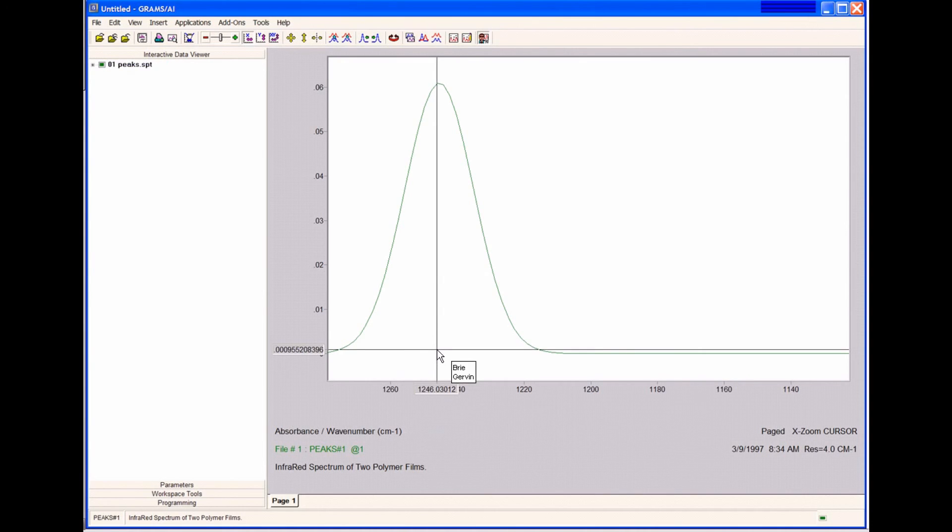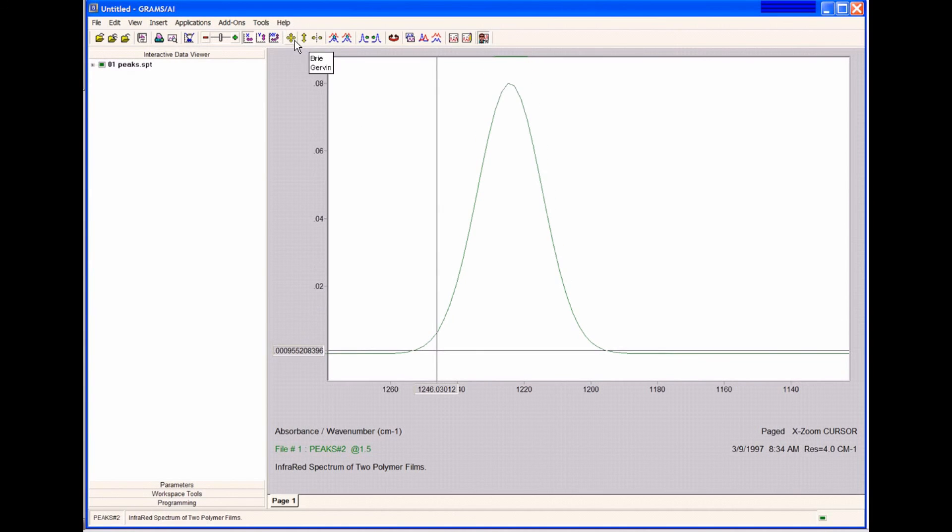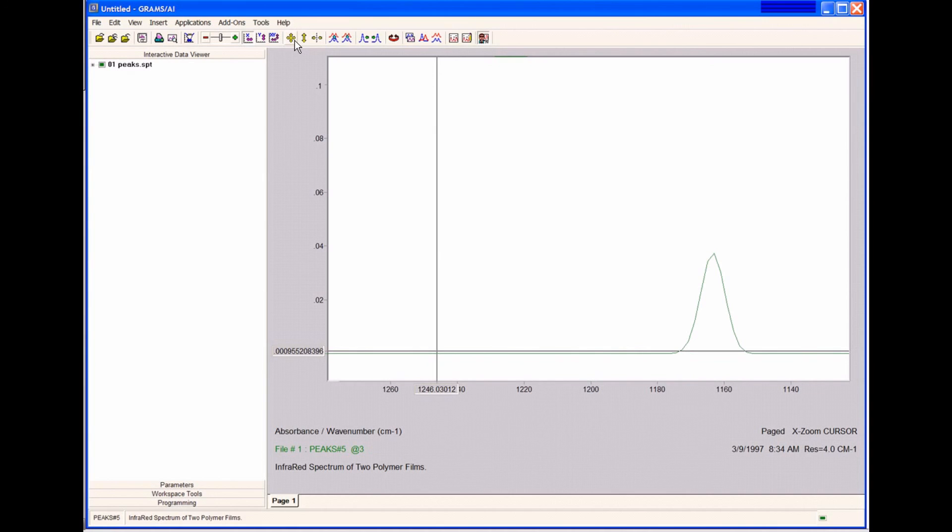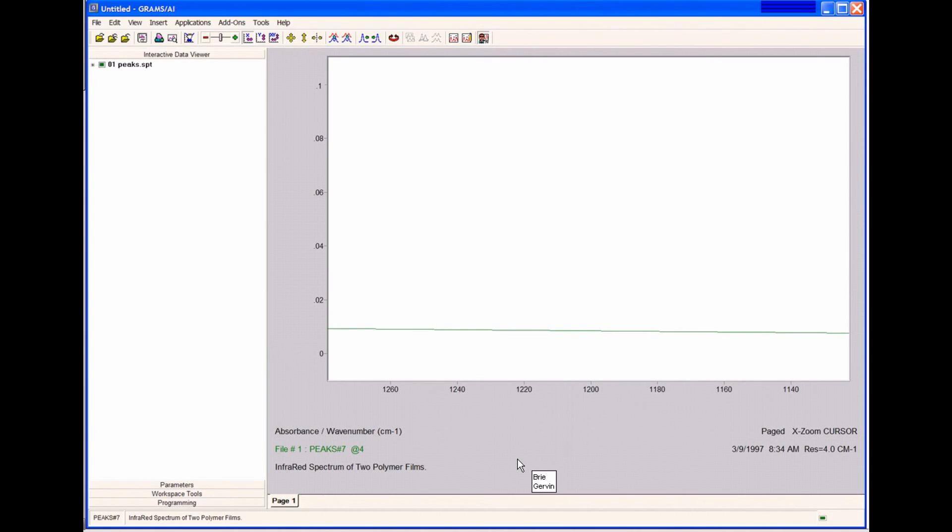If I hit the Page Down button in Grams, I can toggle through that multi-file. Here's our second peak, our third peak, our fourth peak, our fifth peak, our sixth peak, and our baseline. Those are all now saved.